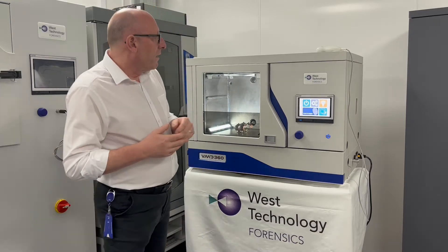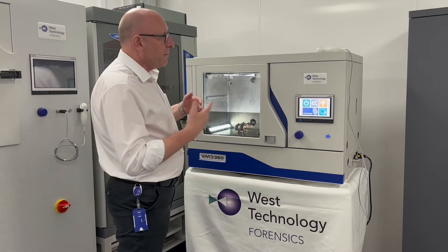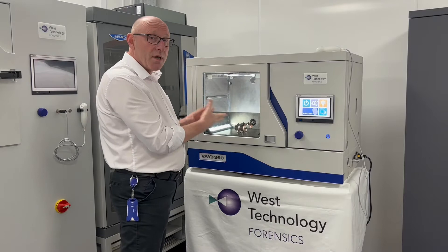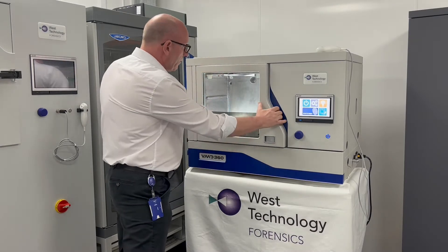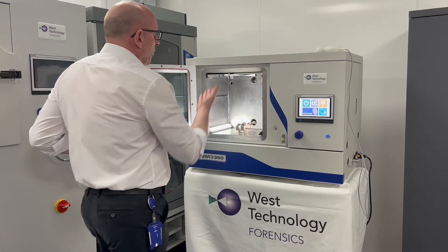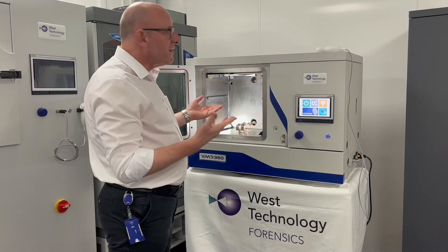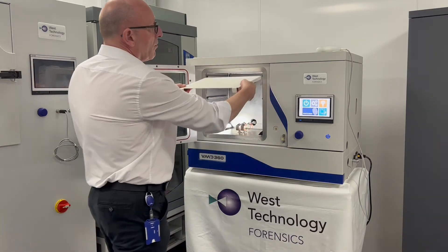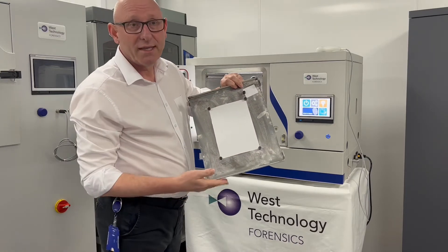The VMD 360 is made up of a vacuum chamber and this is where we're going to do the processing. Inside the vacuum chamber we place our evidence onto an evidence holder. In this instance we have a flat evidence holder where we have pre-loaded a piece of paper with a latent print present.